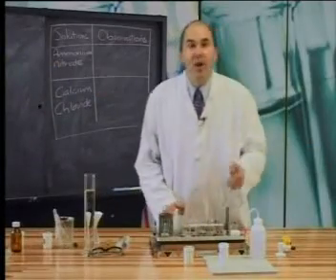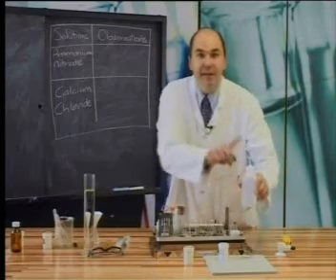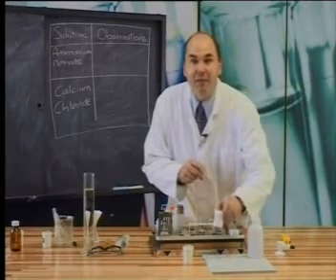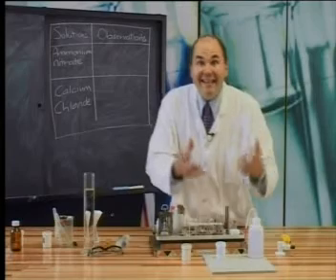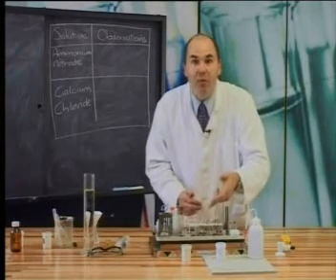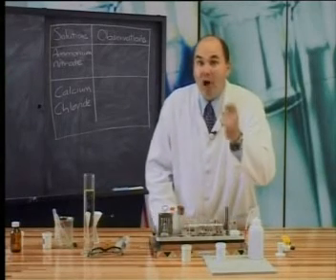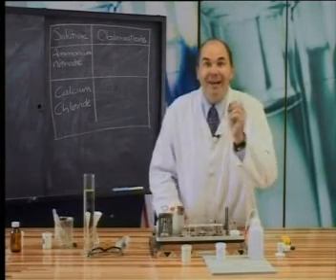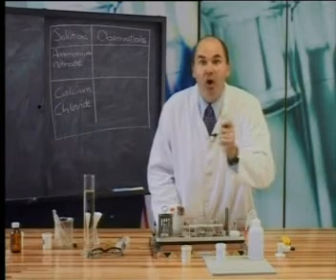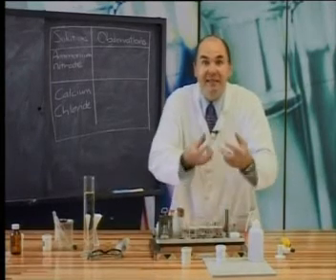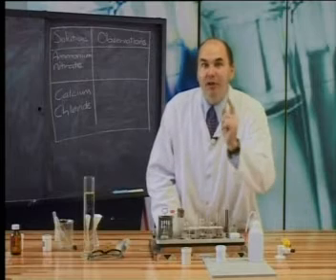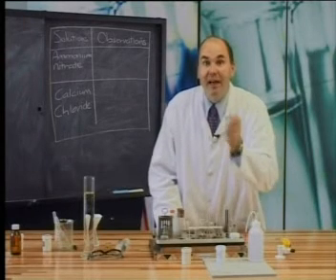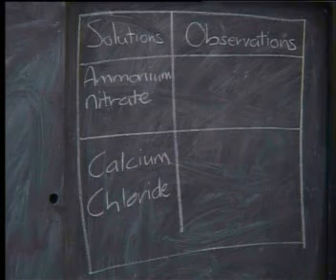Hi there. For this experiment, all we'll need is some water, some calcium chloride and some ammonium nitrate. We'll add these to test tubes containing water to see if they really get hot and cold, just like the instant hot packs and cold packs do when the seal inside them is broken. But before we do some experiments, make sure that we've got a table ready to record our observations. Here's mine. Compare it to yours.